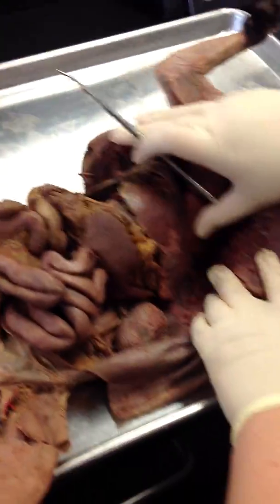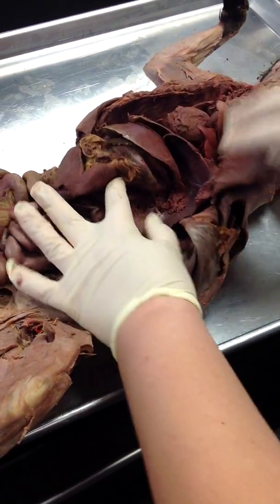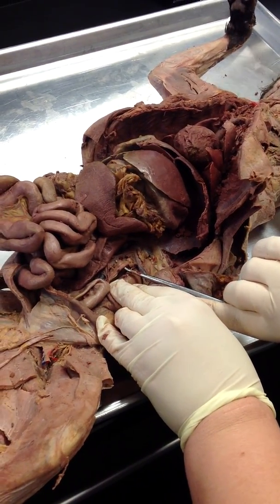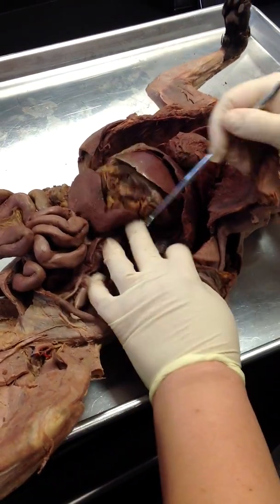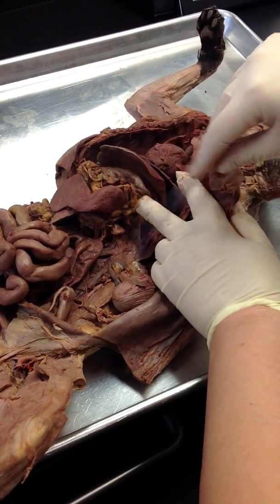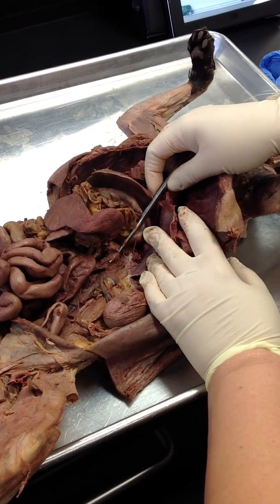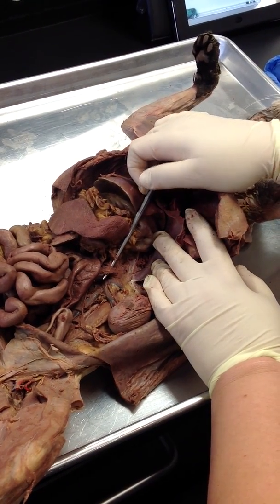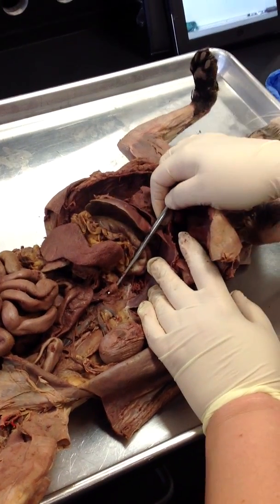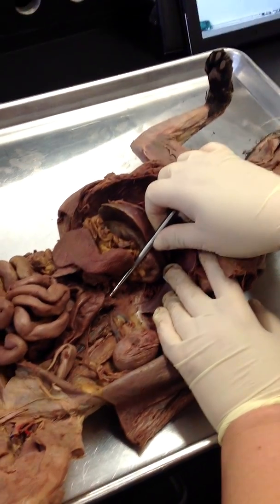All right, so here we are. So our abdominal aorta, right? Big red thing down there. Okay. And so these two, what are the two arteries that come off here? They make sort of a fork. What's this top one? Celiac artery. Look at the picture. I can't see that far. Celiac artery. So then the next one would be the superior mesenteric artery, right?